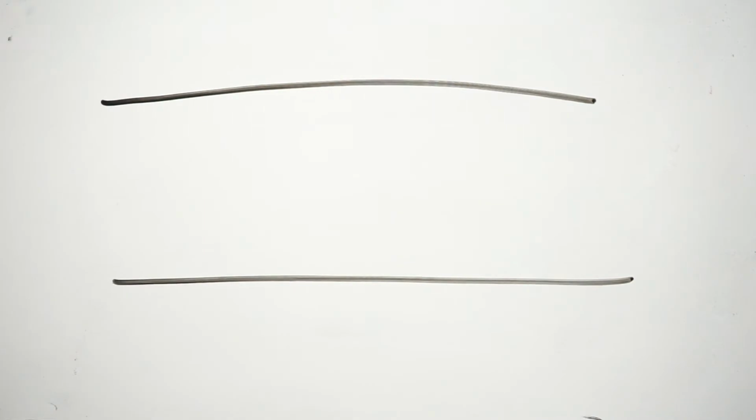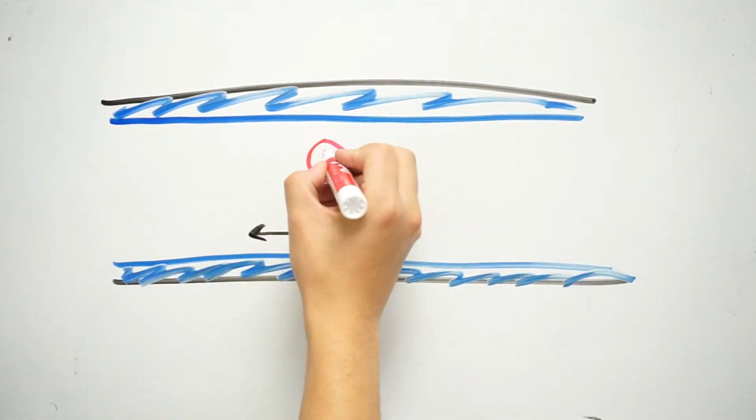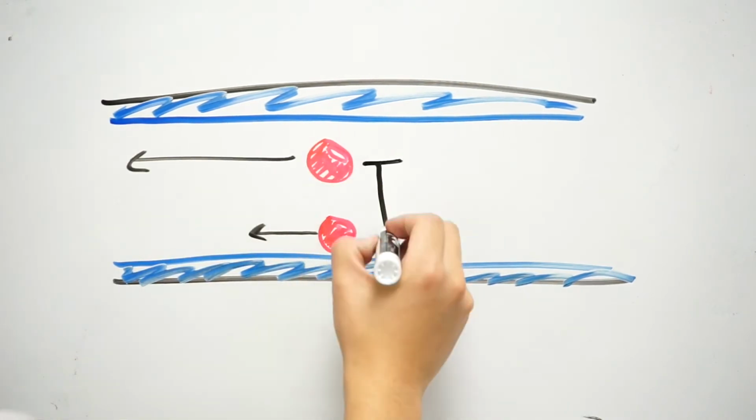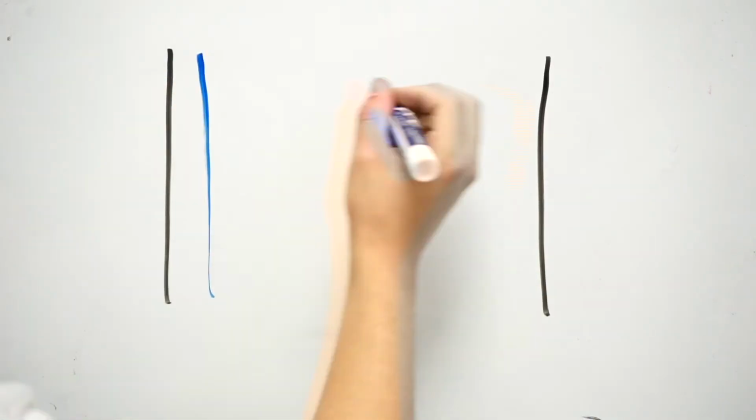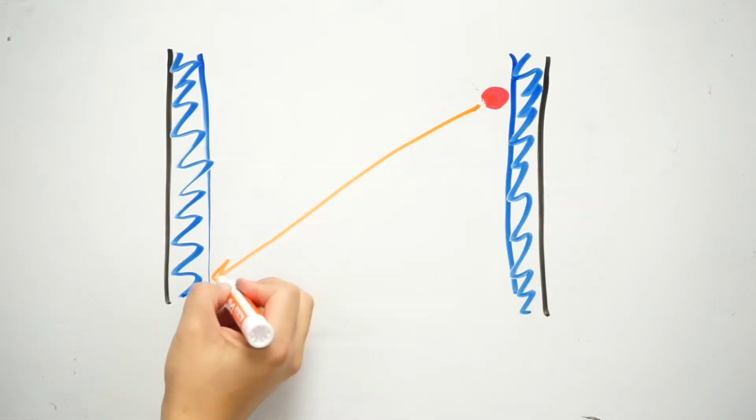First, we'll take a look at the mobile phase contribution. This effect comes into play as a result of differences in the linear flow rate closer to and farther away from the stationary phase. So what does that mean? As the analyte diffuses out of the stationary phase, it is swept up by the mobile phase and, depending on the flow rate, will travel a certain distance down the column like so.